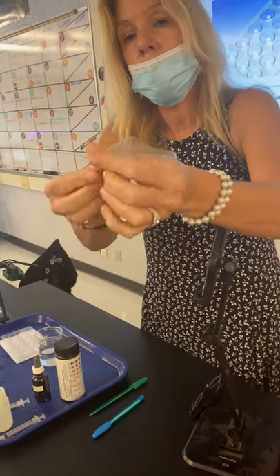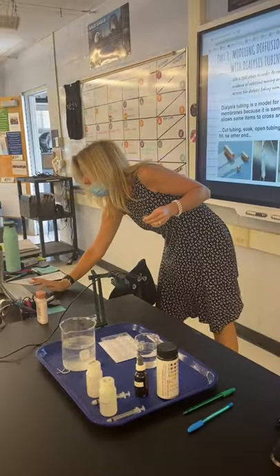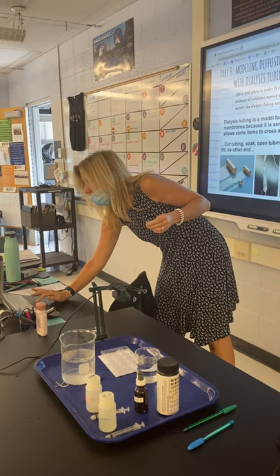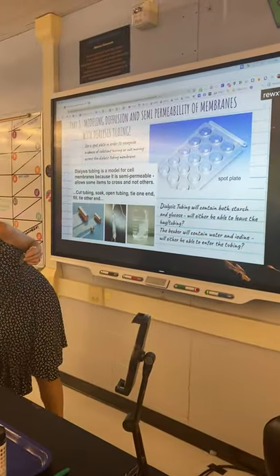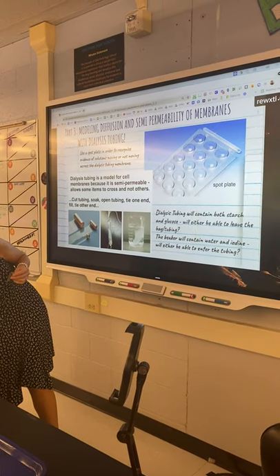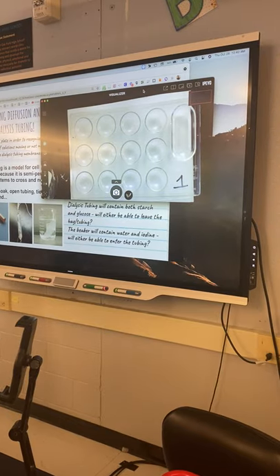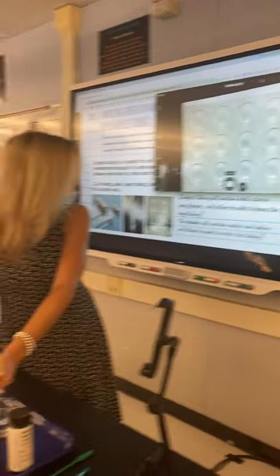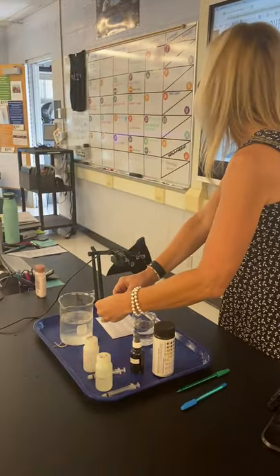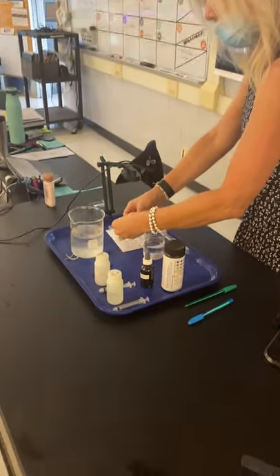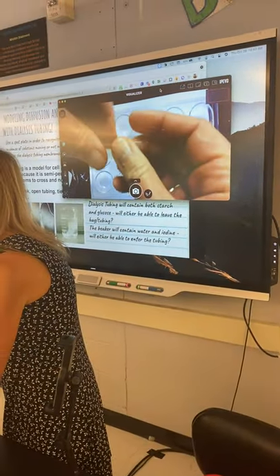The dialysis tubing will open up. I'm going to put this up on the board so you can see. Can you see the dialysis tubing? I'm running it between my fingers and it's open on either end.